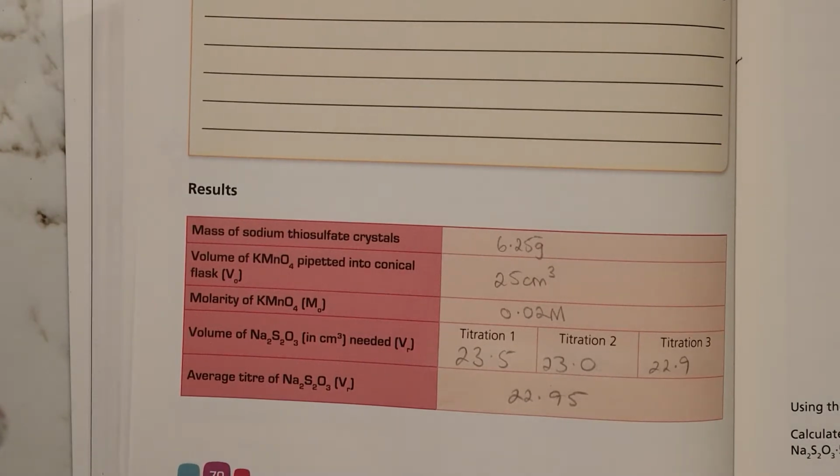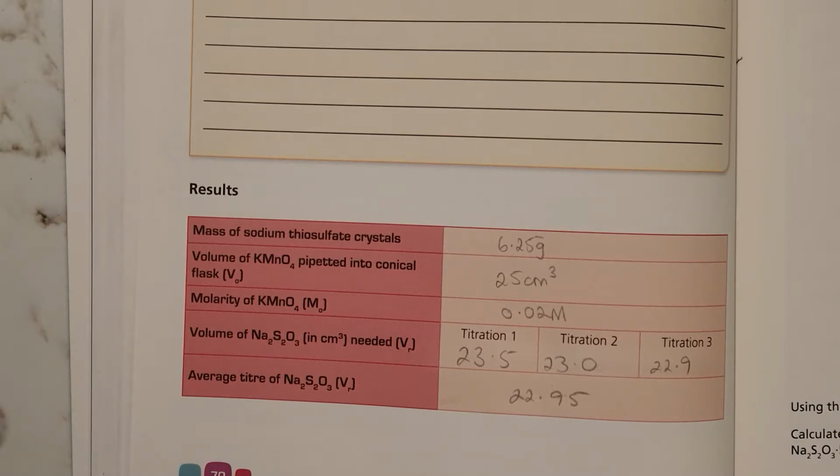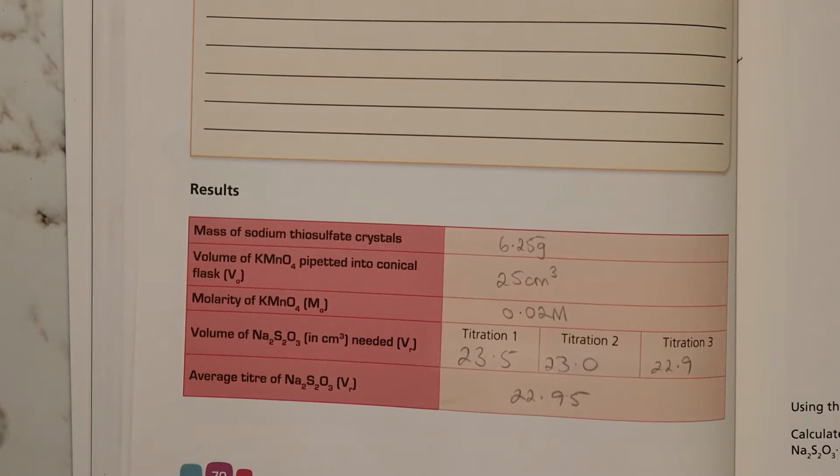You might not have got exactly that, but that does not matter because what we're working out here is the actual concentration of that. So write down exactly what you got. The volume of the potassium permanganate was 25 centimeters cubed, as per usual from our pipette. The molarity then, depending on your previous experiments, could be 0.02, 0.018, 0.014, whatever you got, but you can put it in here.